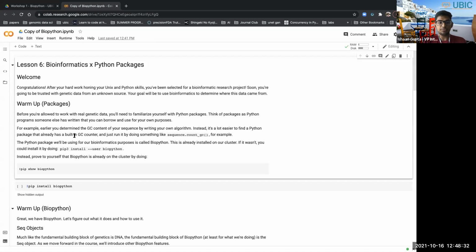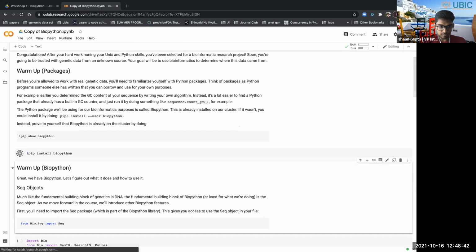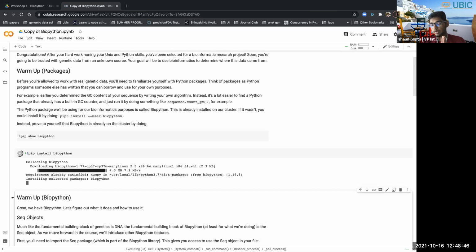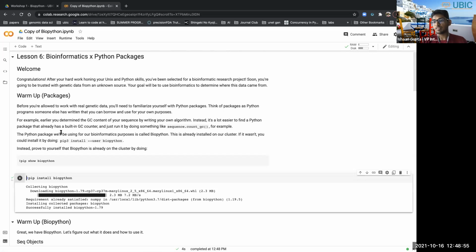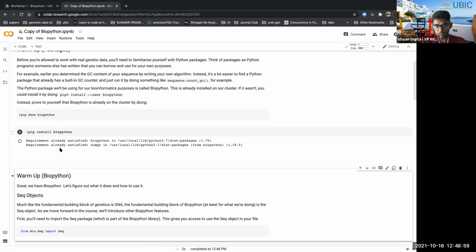All right. First of all, you need to get Biopython, because when you start with Colab, you won't have it by default. It won't take long. All you have to do is run this. On Colab notebooks or Jupyter notebooks, to run a cell, click on the cell if it's not selected already, and then press Shift plus Enter or Shift plus Return, and that should run the cell.